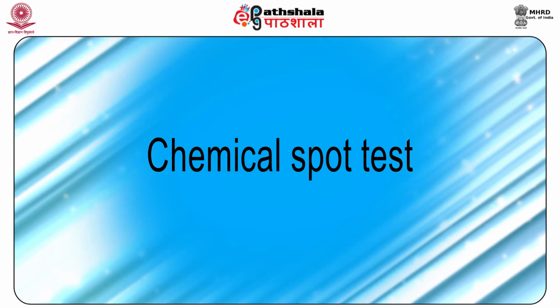Let us discuss chemical spot tests in detail. Prior to advanced techniques, inks were chemically analyzed and differentiated by chemical spot tests performed on the ink itself or on small fragments of ink strokes punched out from the ink line with the help of a scalpel, hypodermic needle or punching plate, etc. And now these chemical spot tests have been replaced by thin layer chromatography and other sophisticated techniques. However, in some cases, the spot test may prove useful for conducting preliminary examination. Numerous reagents have been suggested by different workers for performing spot tests. The following reagents may serve the purpose.